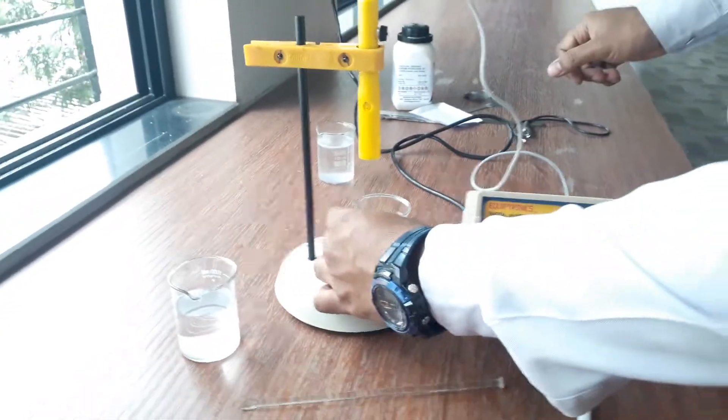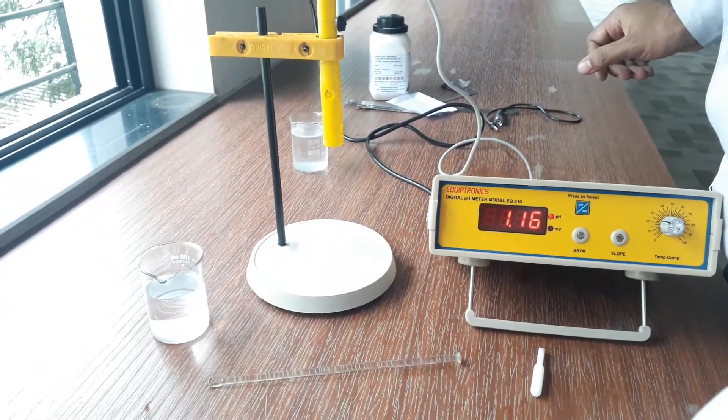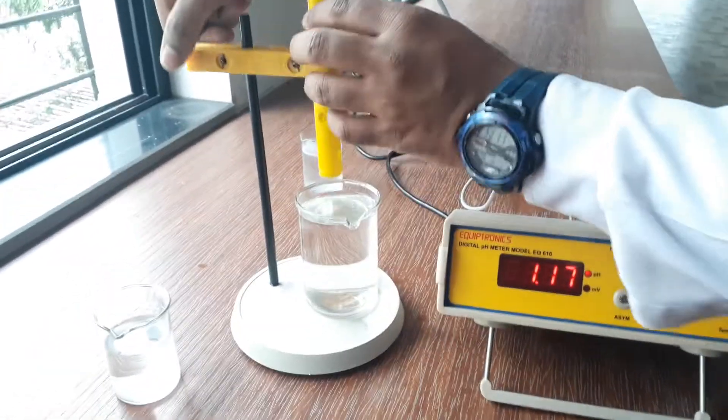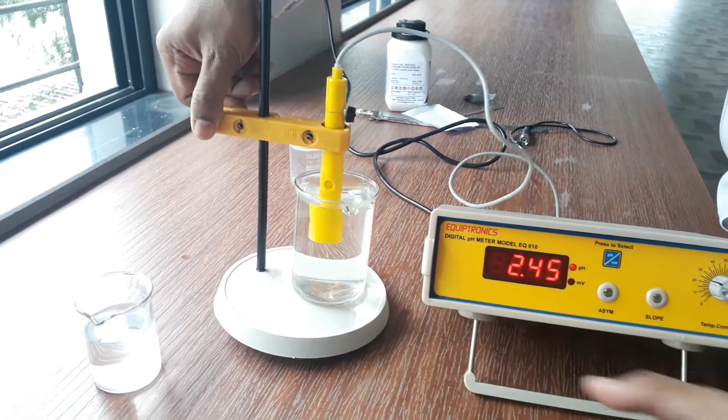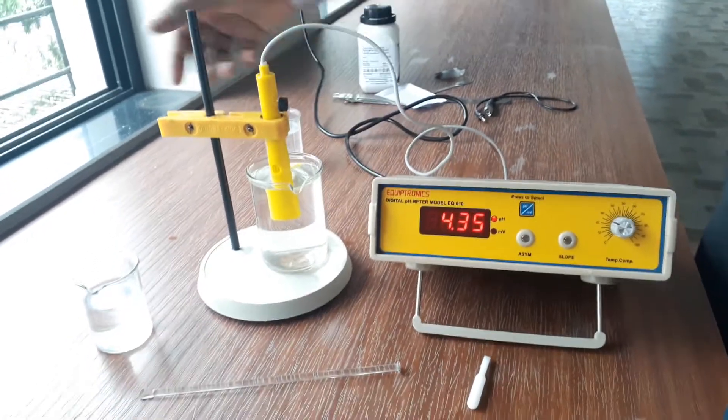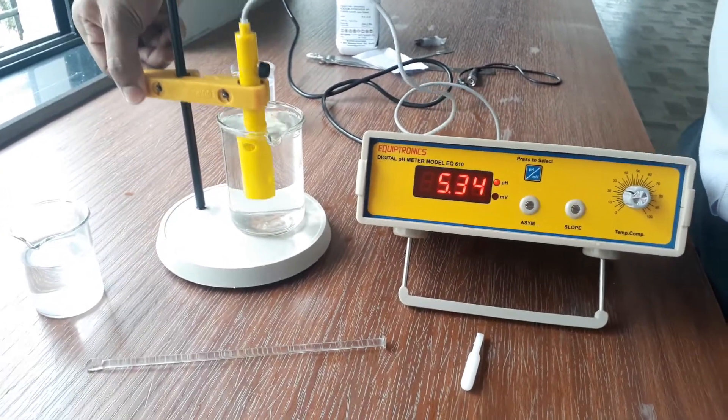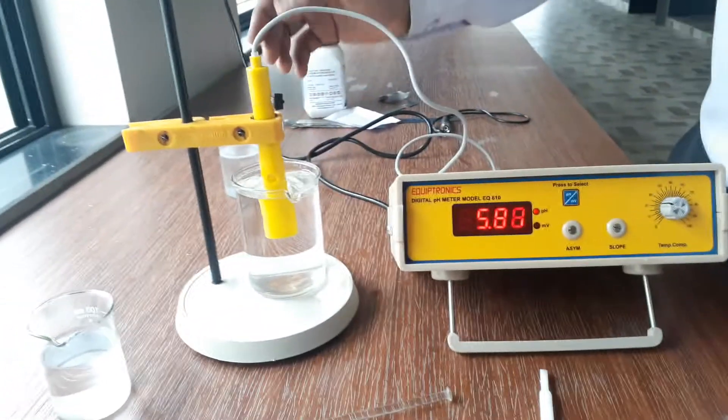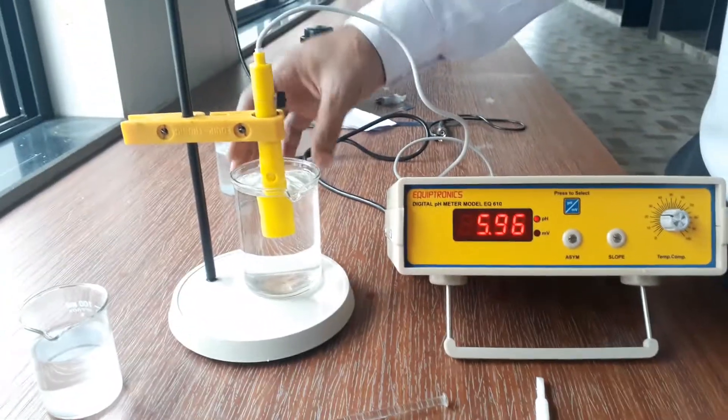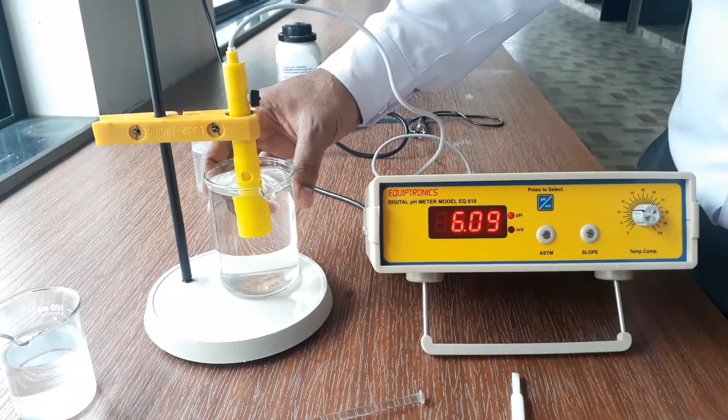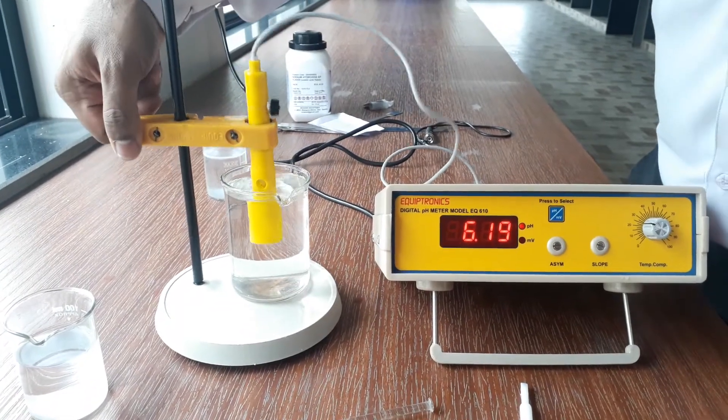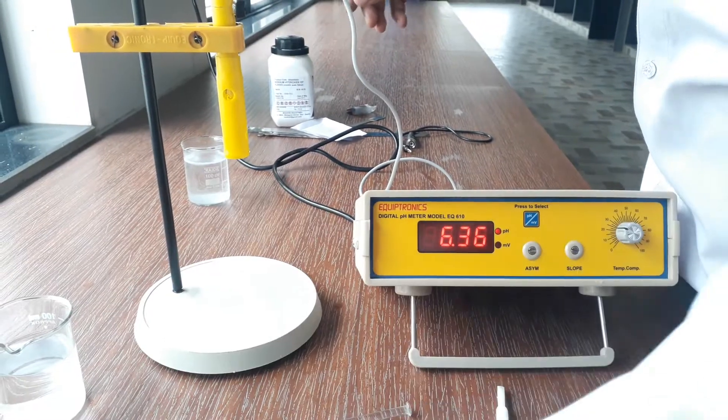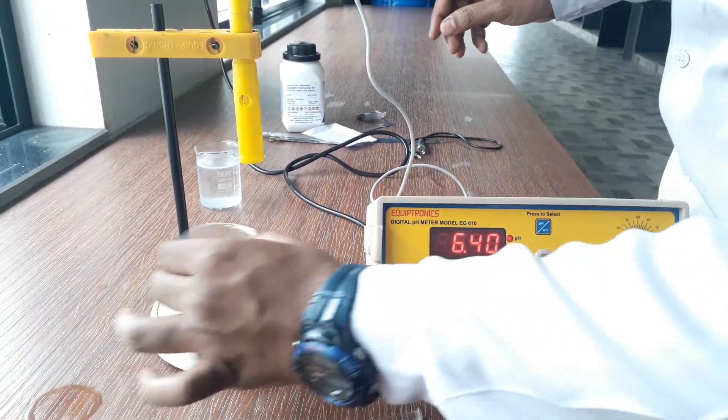Before this we have dipped that solution in the acid, that's why we have to wash this electrode so that there will be no part of acid which is attached to the electrode. So we can wash this electrode first so that whatever minor acid or base is there will be removed. Now we will again take the next solution that is a basic solution.